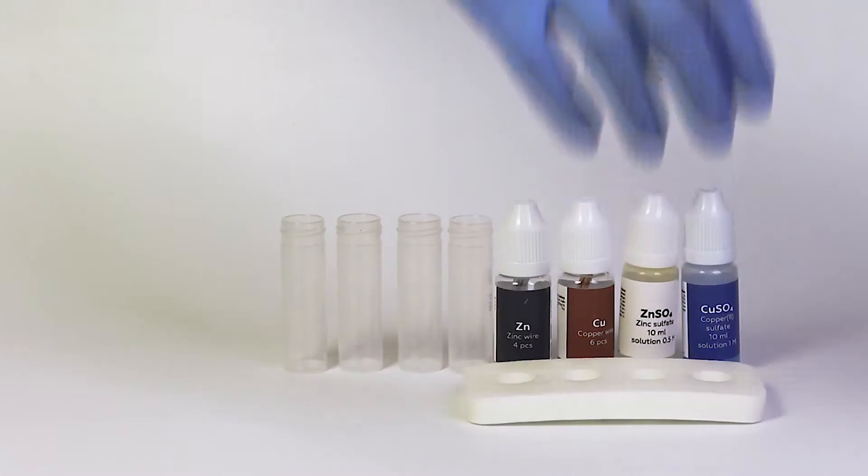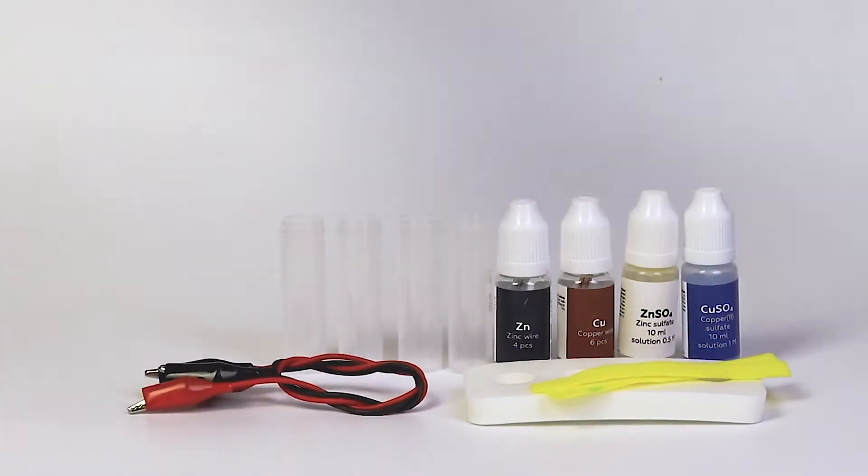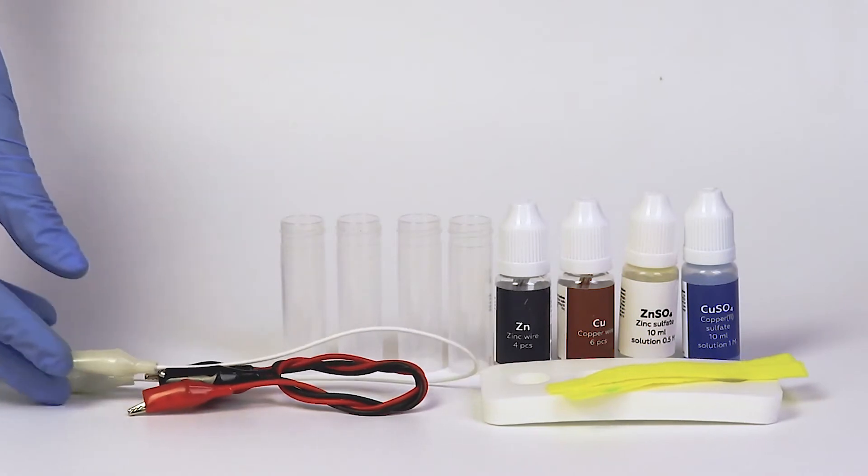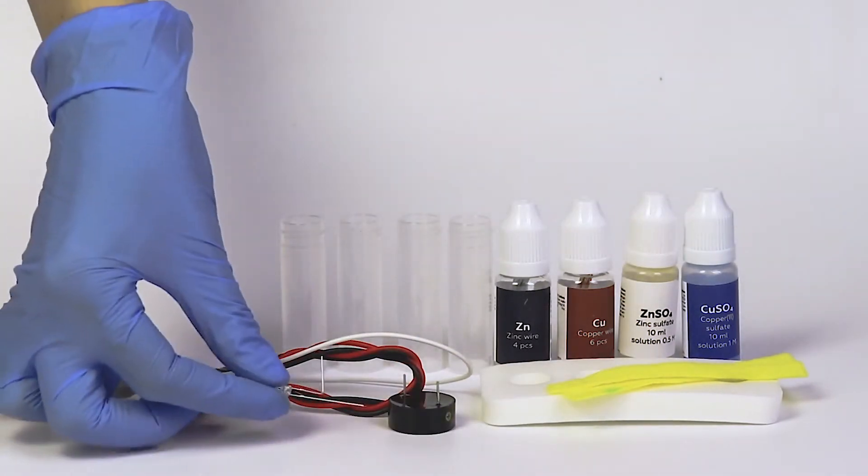a vial holder, two strips of absorbing fabric, a set of crocodile clip wires, a buzzer, and a light emitting diode.